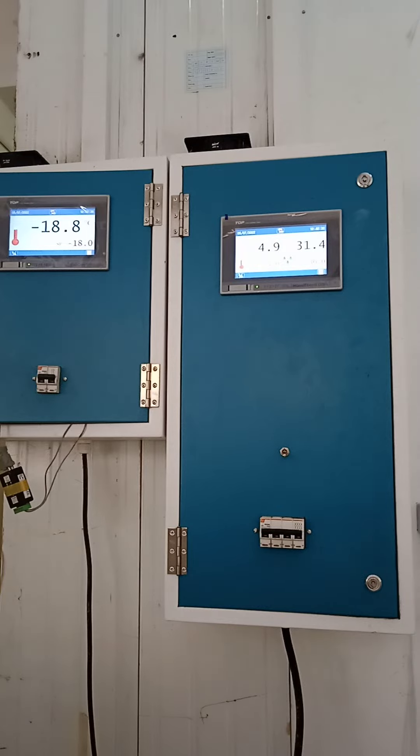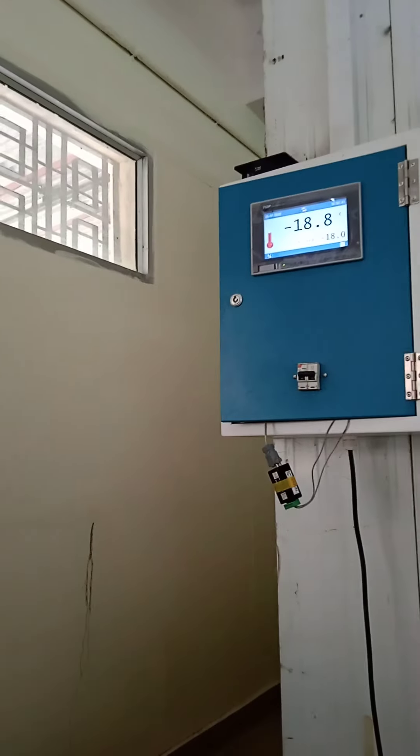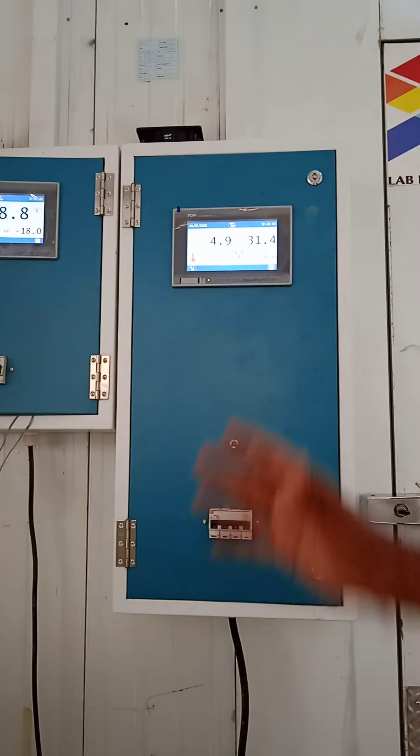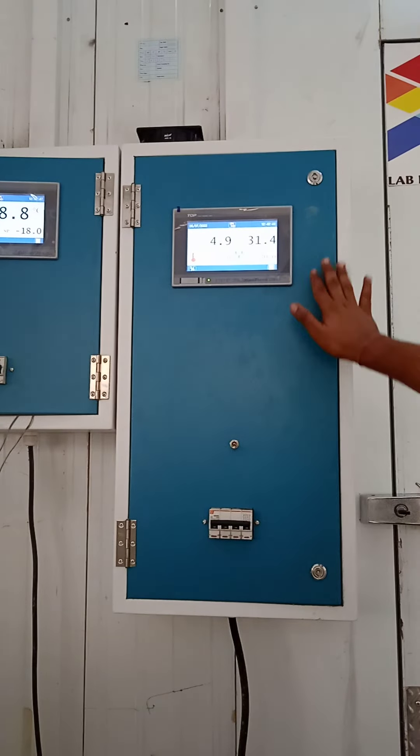So you can see our power supply also. This is the power supply from three-phase — the power is coming here. It's a three-phase power supply.